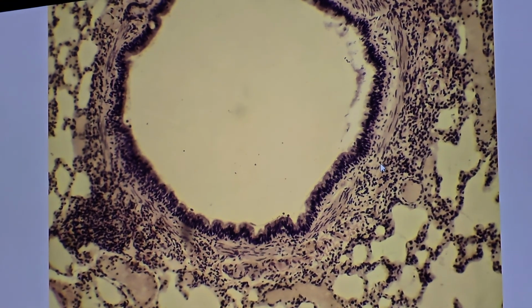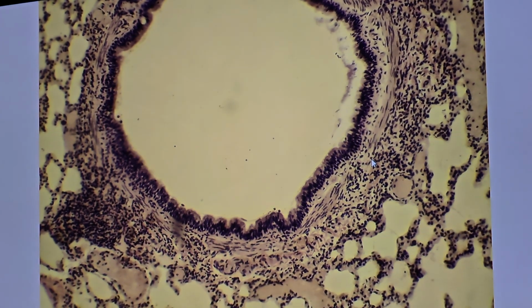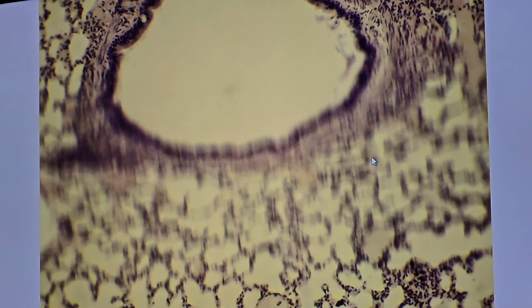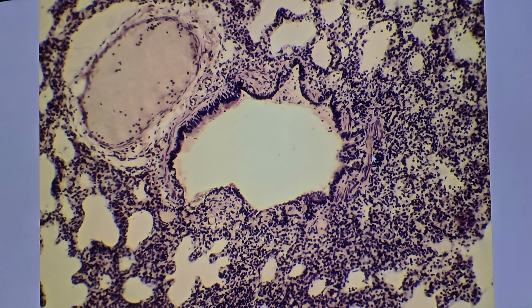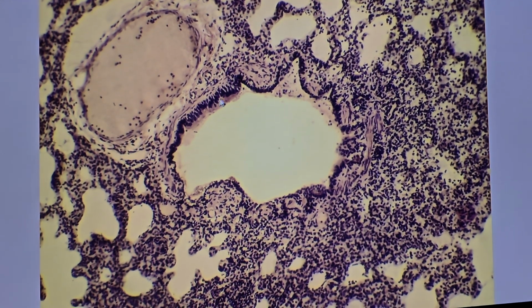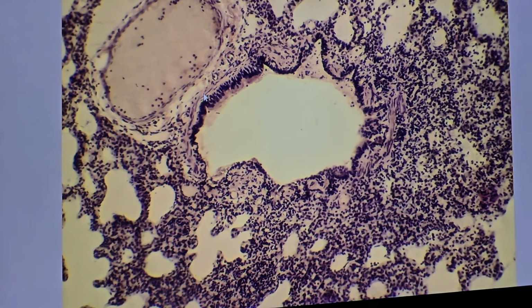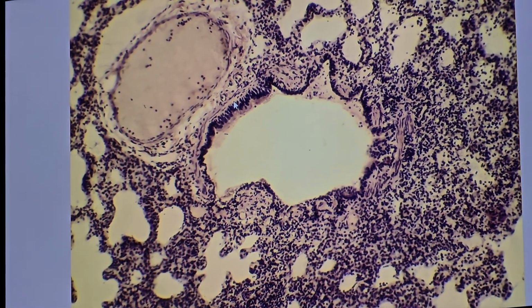Okay? So you distinguish bronchus from bronchiole by the presence or absence of cartilage and glands. This is pseudostratified columnar epithelium, lamina propria with smooth muscle fibers. This is the wall of bronchiole.